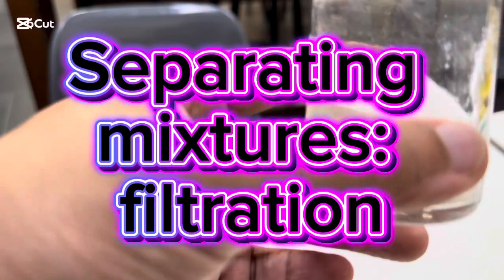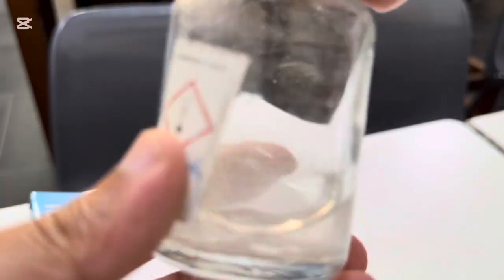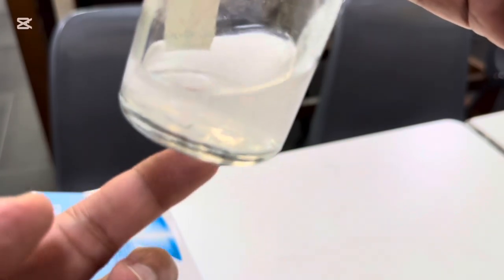Filtration is a process that can be used to separate a solid from a liquid. I have a bottle here, which is an indicator called phenolphthalein, and I've just selected this because it seems to have a solid within the liquid but not fully dissolved. I'd like to see how much I could actually remove from this liquid to give a lovely colourless solution. I'm suspecting that I would get a colourless solution if I use filtering.